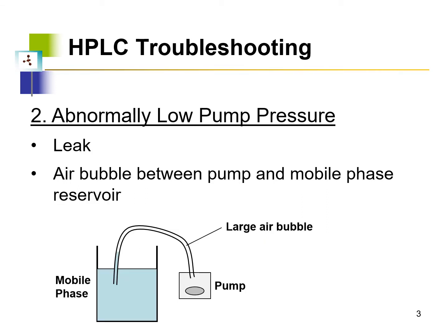The next potential issue is abnormally low pressure, which is the opposite of high pressure. Low pressure is typically indicative of a leak in the system. A leak could occur where the line is connected to the column — if it's not tightly connected, it can cause liquid to leak out, presenting as low pressure. Sometimes various parts such as connecting joints become worn out and old, so they are not sealed properly and therefore cause a leak.